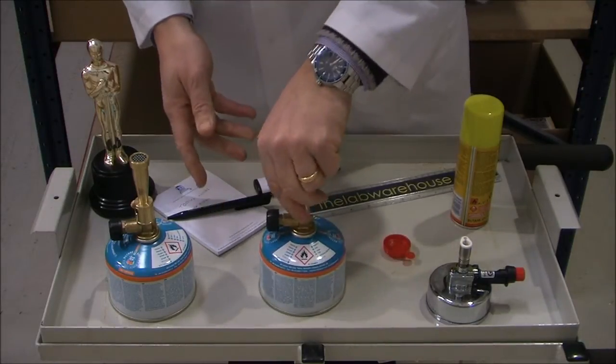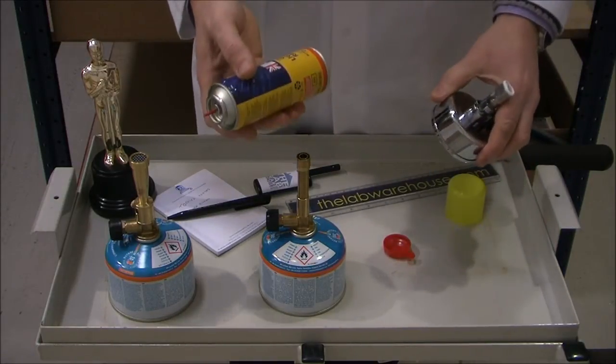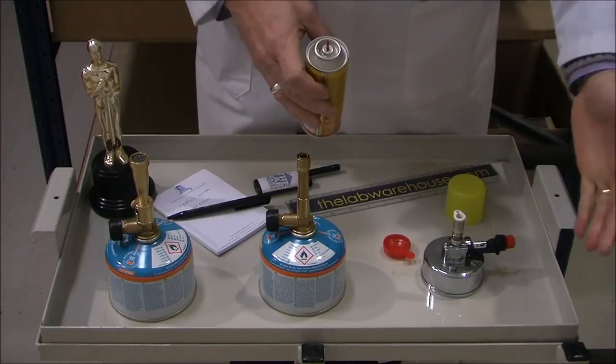You simply screw the burner into the cartridge. The valves are self-opening and they're ready for use. This one can be refilled using one of these readily available lighter refill cans. In goes the gas — you're good to go.